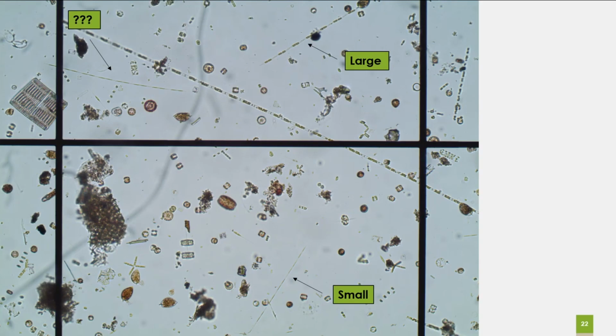This is just another example. It looks so tiny, but that's what it looks like. I mean, this is 10x. This is like the medium power, which you would do your counting on. You move to a higher magnification for your measuring and to get clarification.